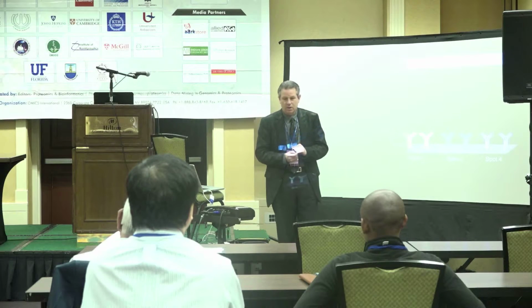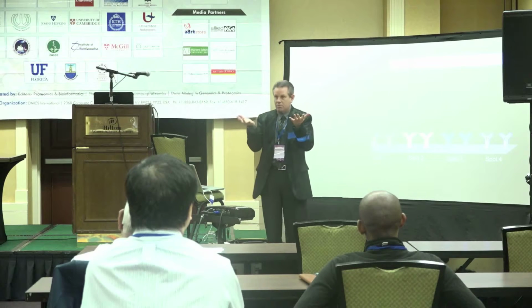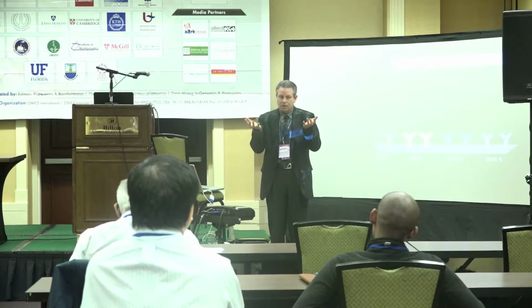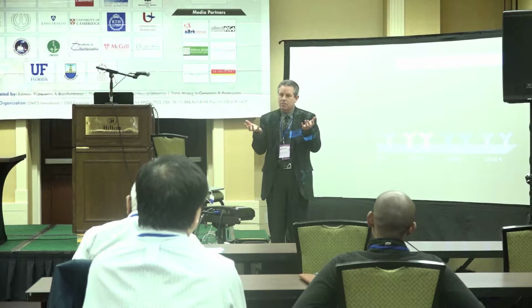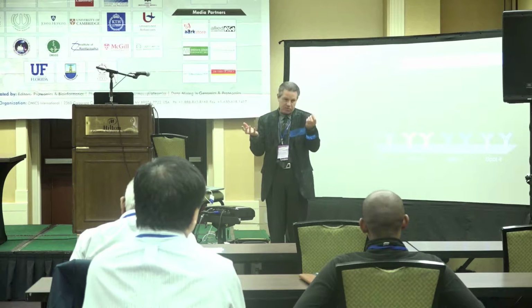It's a very good question. Our assumption is the null hypothesis, that if you have two samples and you've undergone a perturbation, as long as it's the same model system, that there is no change. And so what we do is we sum the intensity of all the signals in each field for every spot, and we expect that the sum of the two fields will be the same.